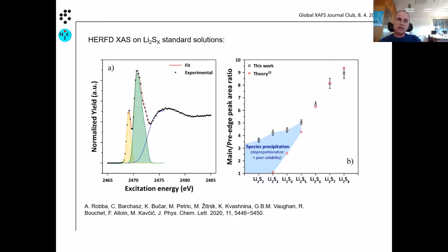But when you are interested in, for example, just polysulfides, then it's much more effective to use the RIXS. It's very fast, it's very sensitive. With the people from CEA, for example, we observed some effect of the particle size. You immediately switch on, change the potential, and you see the formation of the polysulfides immediately. And if you have a good normalization, which is not so difficult for the polysulfide itself, this is favorable for sure. Thank you.